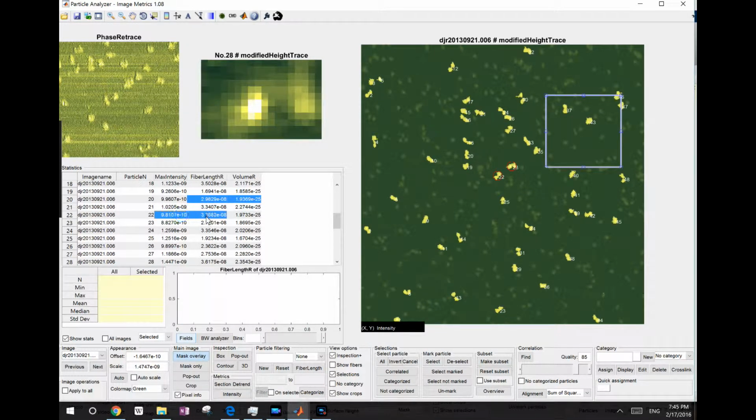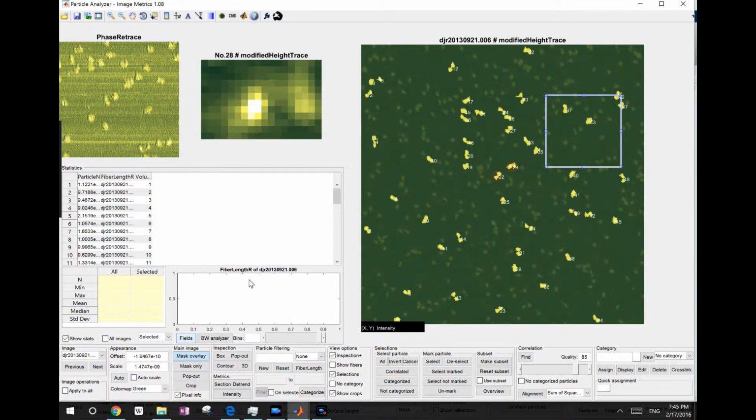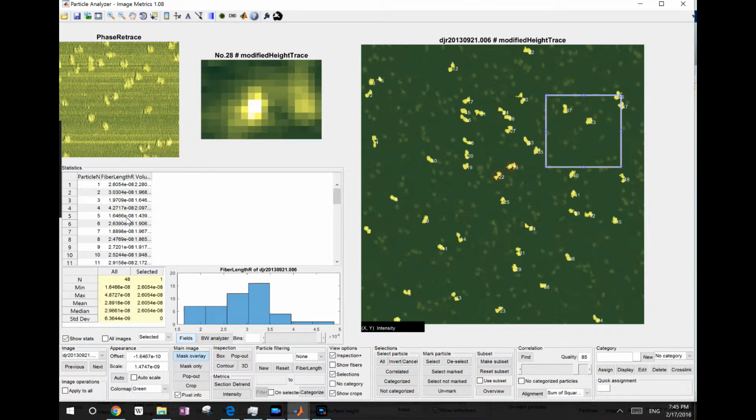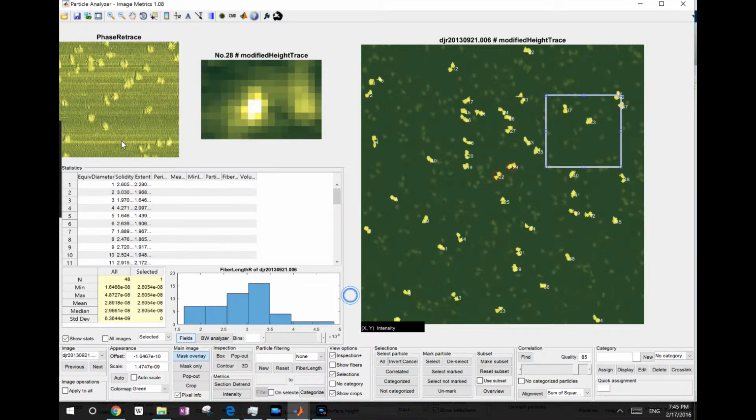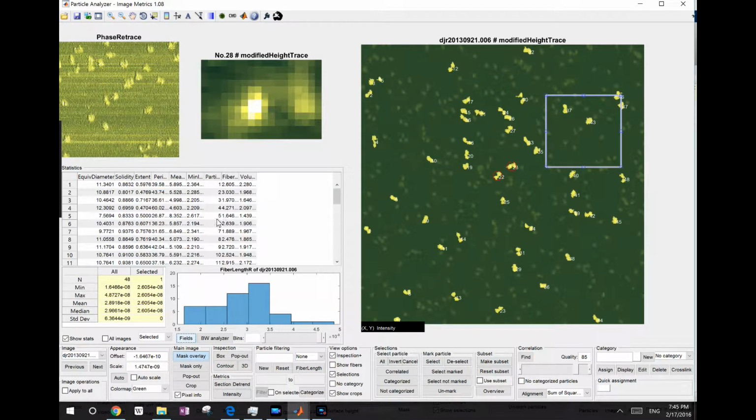So then you can hide all 3 columns, or only show those 3 columns. Only these 3 columns are shown there. That's basically the same thing as using the fields option. If you want to see more than that, you just expand the fields that you want to show.